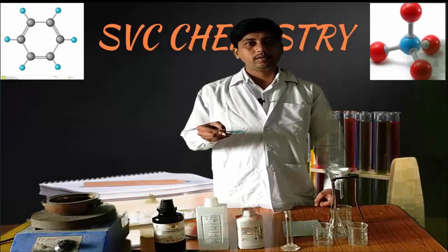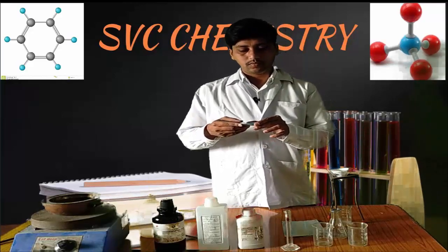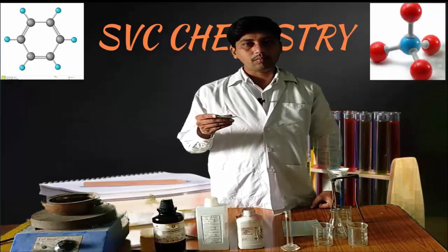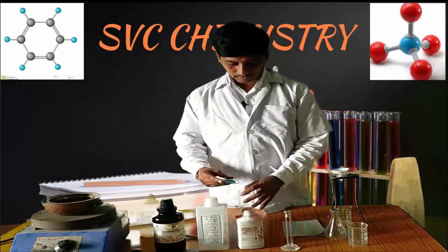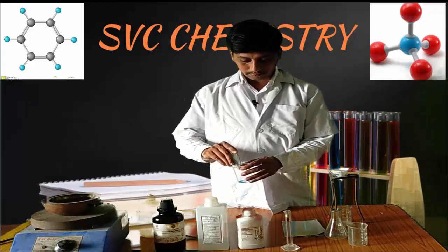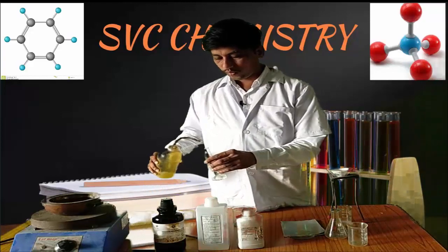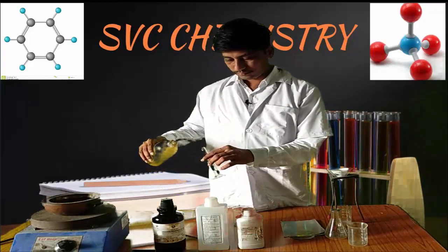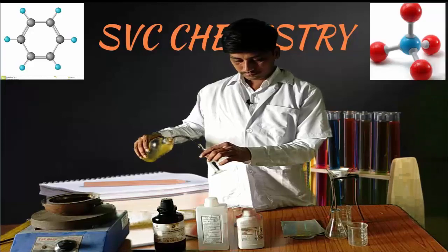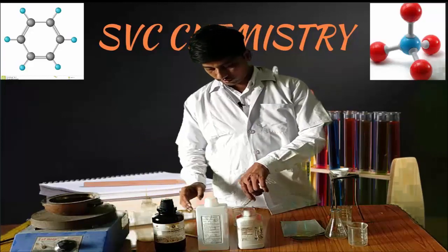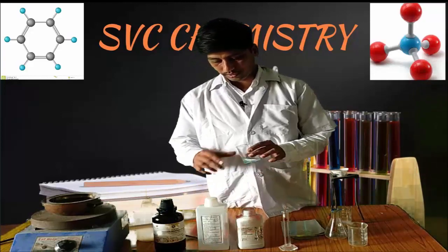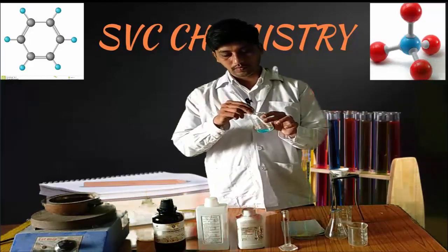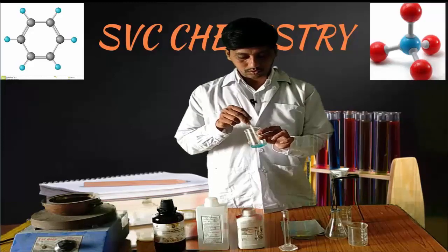Now we will see the procedure of this practical — how to do the practical. We will see the demonstration of preparation of tetramine copper two sulphate complex. For this, we require 1 gram of copper sulphate. Take this copper sulphate in a beaker and add 5 ml of distilled water. Add 5 ml of distilled water and dissolve the copper sulphate to a clear solution.